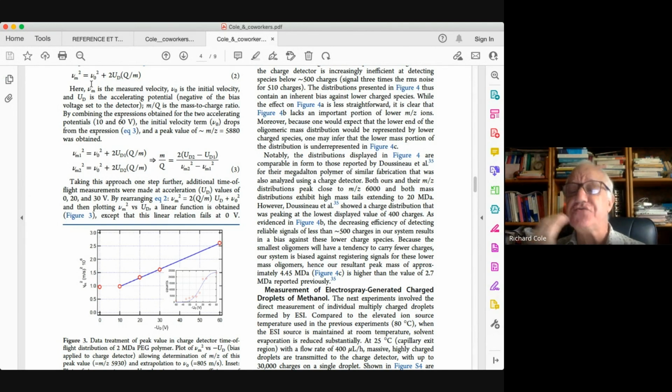So we're doing electrospray under atmospheric pressure. Then we have 2 regions of differential pumping, and then finally our analyzer region, which is at about something like 10 to the minus 5th millibar or so, maybe a little bit lower. So what determines our initial velocity here? Well, it's really that vacuum that's pulling ions into the mass spectrometer.